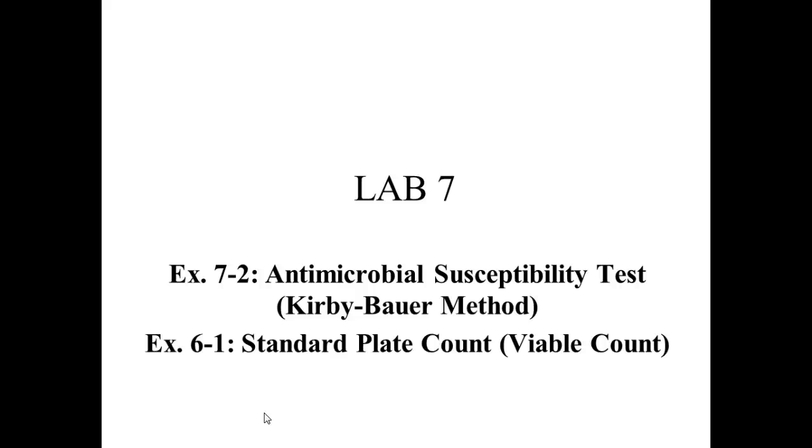So today we just did an antimicrobial susceptibility test. Sometimes it's referred to as sensitivity. Those two terms are kind of used interchangeably. And we used a particular method. Just remember how when we did the staining, there were different methods out there. So this is one particular method for antibiotic or antimicrobial susceptibility, and it's the Kirby-Bauer.